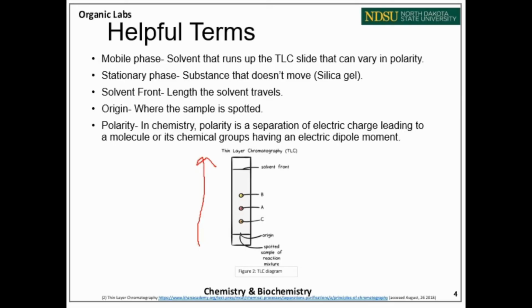Next, there's the stationary phase. The stationary phase is the substance that doesn't move. In our case, it's going to be silica gel. More specifically, it's going to be silica gel coated on a rectangular slide that will be provided for you. This is shown on the image below.